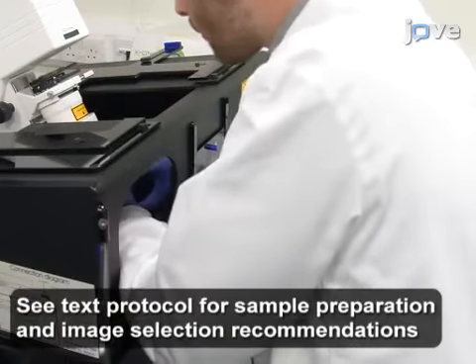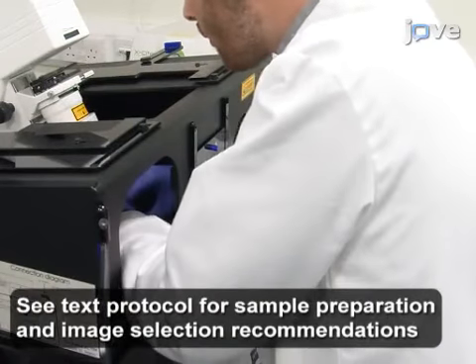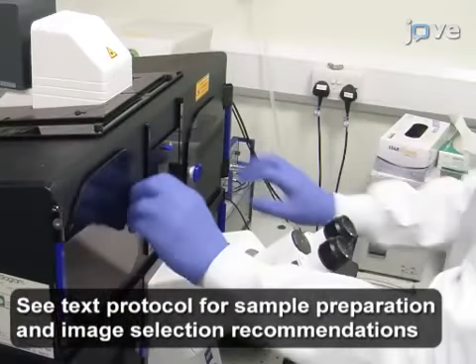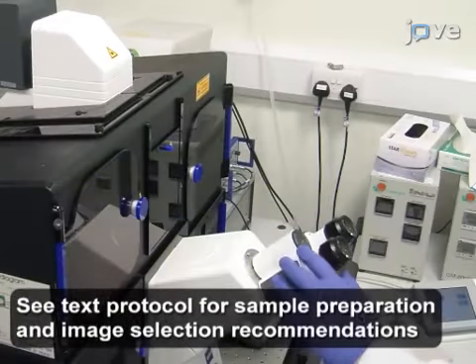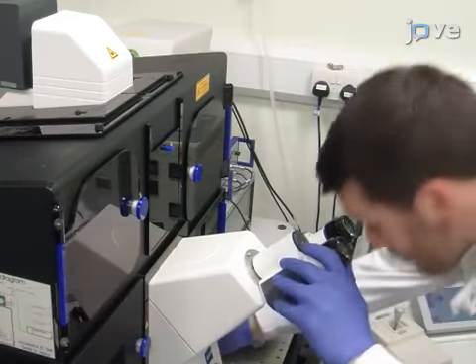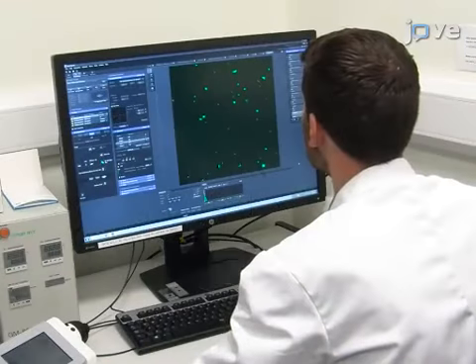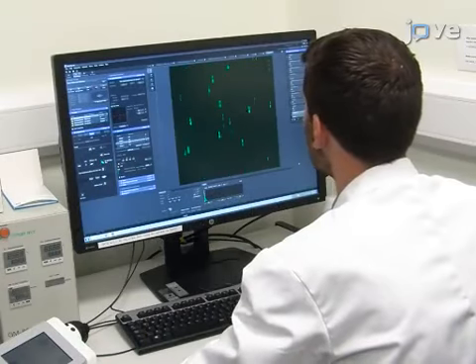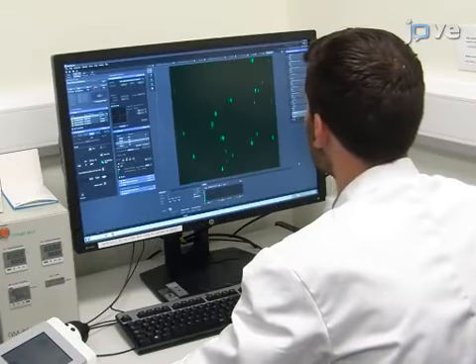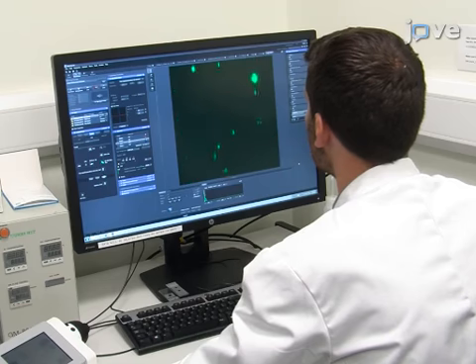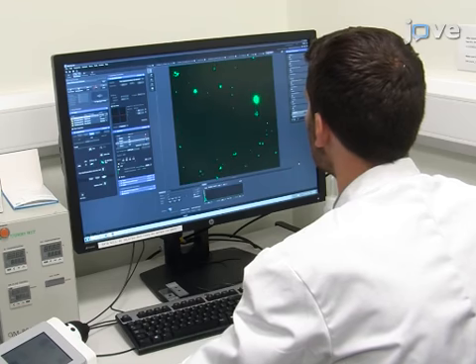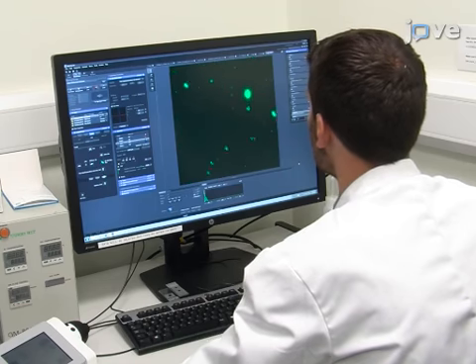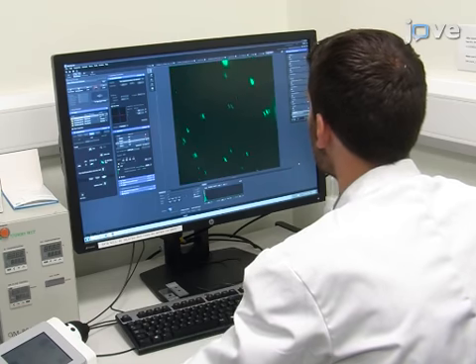First, image the sample with super-resolution fluorescence microscopy. Acquire images of several fields of view containing hundreds to thousands of well-separated particles with no unwanted fluorescent structures.